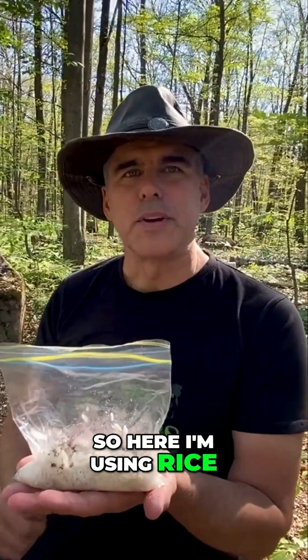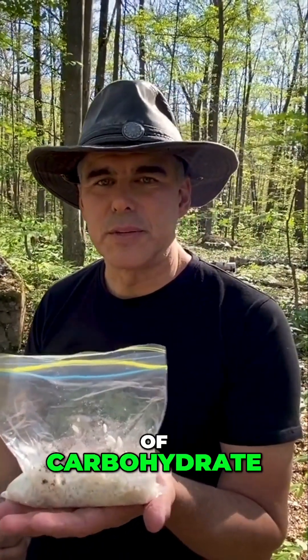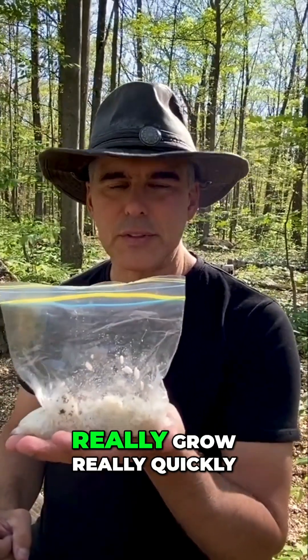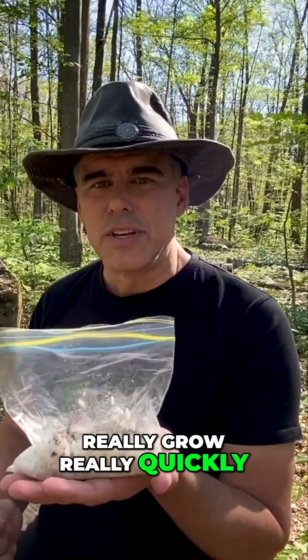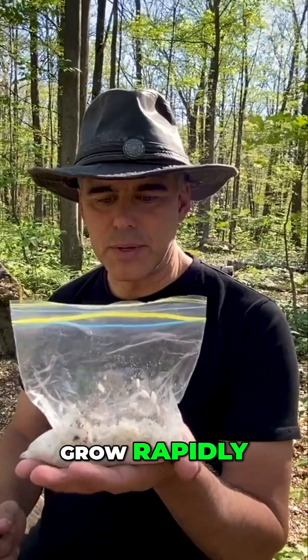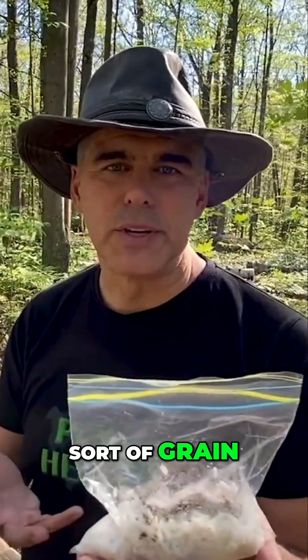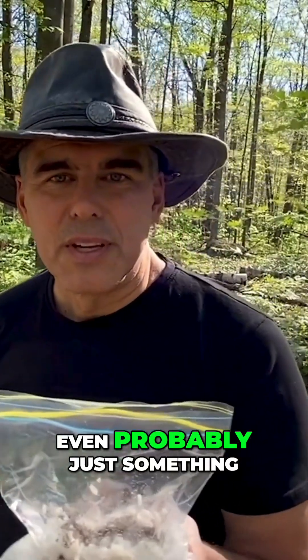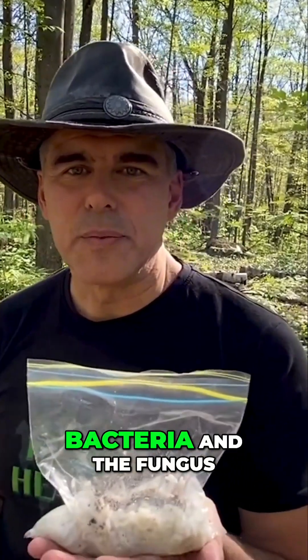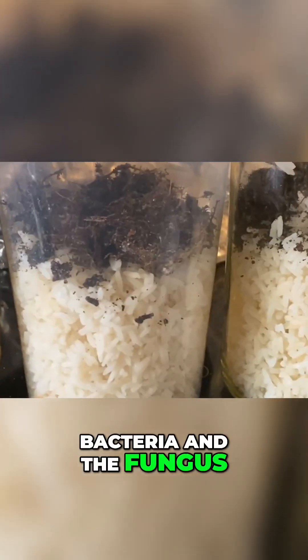Here I'm using rice, but you can use any sort of carbohydrate — it's just an energy source for the fungus so that it can grow really quickly, and it provides a substrate for them to grow into and grow rapidly. You can use oats, any sort of grain, cassava, or even potatoes — just something that doesn't inhibit the bacteria and the fungus.